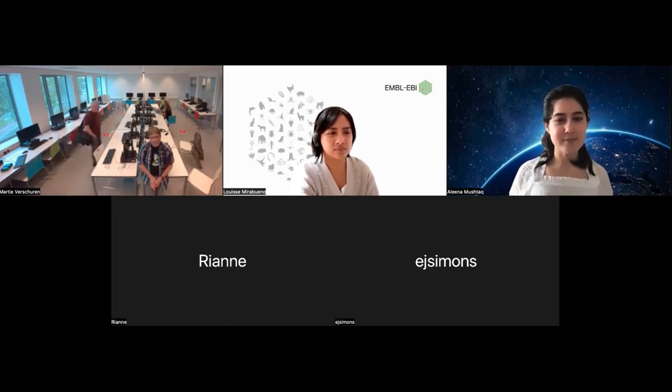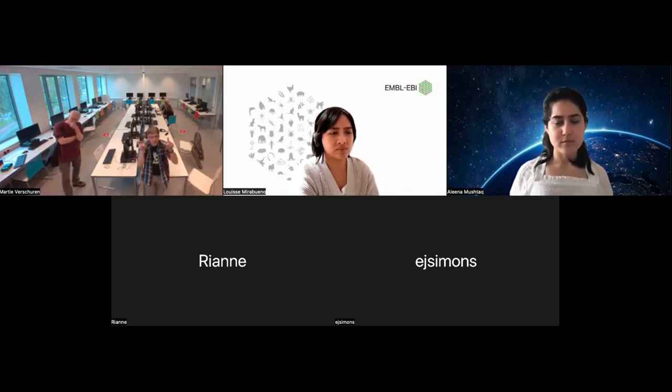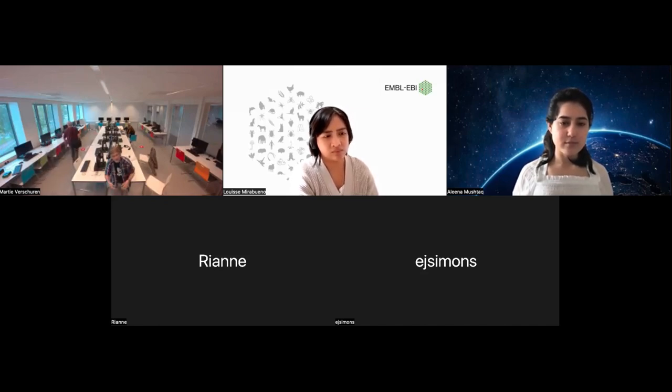I will look at the BLAST option first, because what I did now, and also asked the students to do last time, is that we just download the sequence from a certain cDNA, but then with the intron and the exon changes in another color. Looking at the configuration, you can use only the sequence and you have two colors. But if you download the sequence, the colors are gone. If you copy the sequence, the colors are still there. Then you can look for the primers and see that they are exon spanning, but I will also look at your BLAST option and see if we can just add these two primers and see how they come up in the BLAST session.